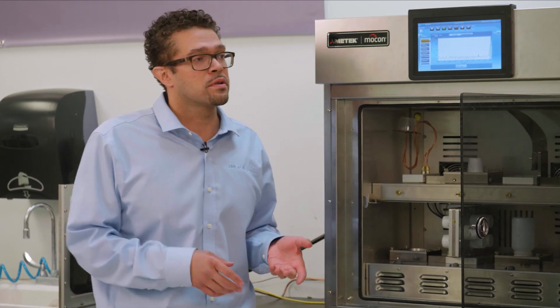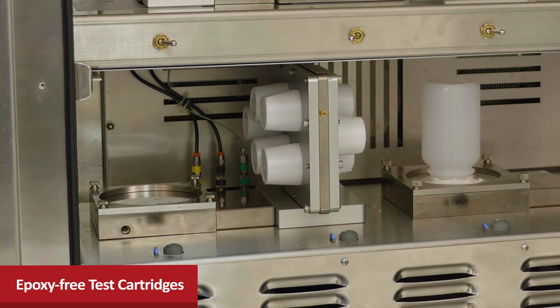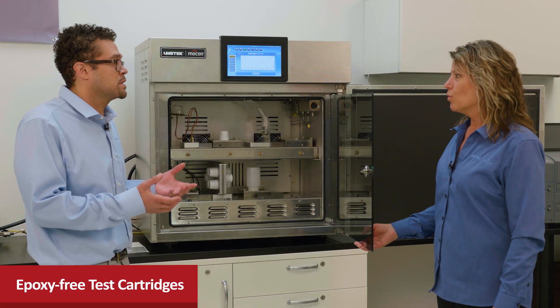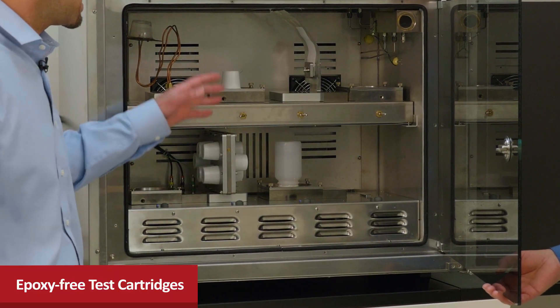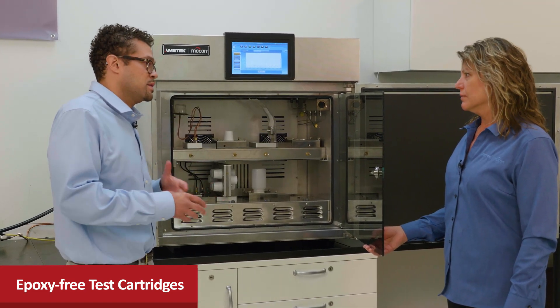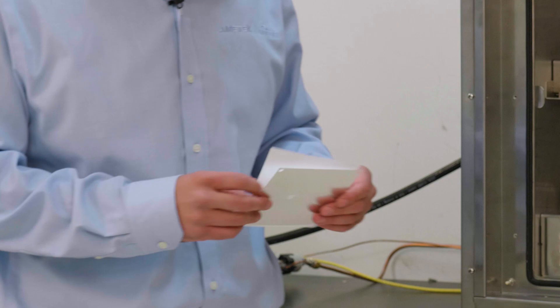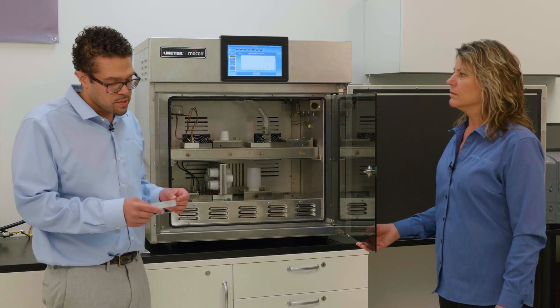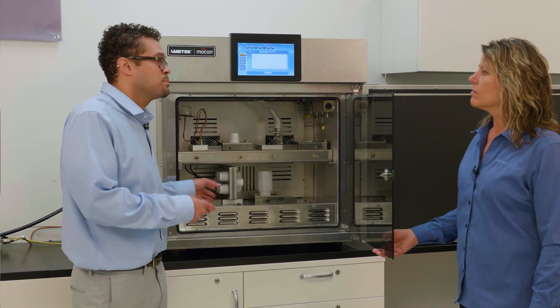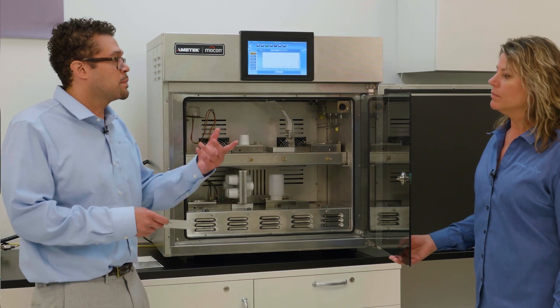How we improve on repeatability even further is we have these epoxy-less test cartridges. As you see, the K-Cup one here — there's no epoxy, so you don't have to worry whether your epoxy is going to set up the same. You always get the same repeatable seal no matter how you test it, as long as you put all of them in the same way. Also we have these pre-cut foils here for testing packages, which allows us to have the same seal every time we go to test, because we'll seal this within a cartridge and place it, engage it in the instrument. This is better than a plate as we're used to doing because of the epoxy issue.